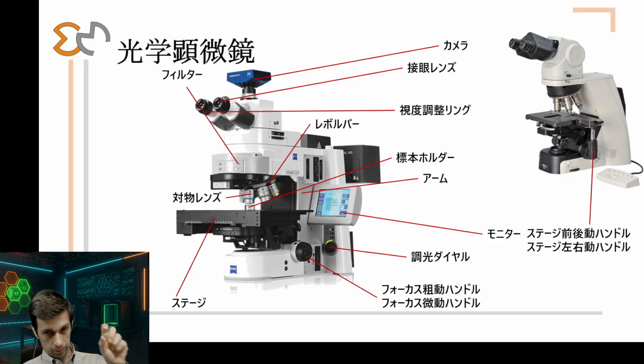Even nowadays there are solid filters that can be used, especially if you do things like fluorescence microscopy. You need to filter some lights. For example, you only need to shine, I don't know, a red line at a specific wavelength to the sample, and you collect red light again, shifted red light probably, back. We need 2 filters, one going to the sample and one coming back from the sample. Red, green and blue are the most common, also yellow.